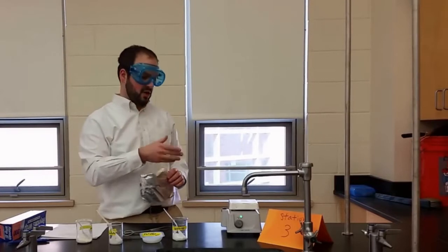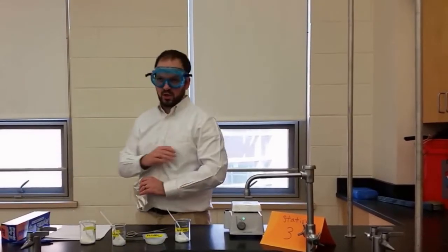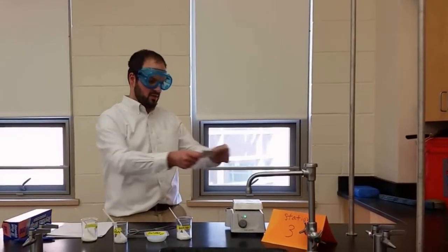This is a hot plate that's very hot. You'll notice it's on right now. You're going to want to be extremely careful of this. No one should turn their back to it. You should avoid your arm getting near it, and you should only be very careful when you go near it and away from it.